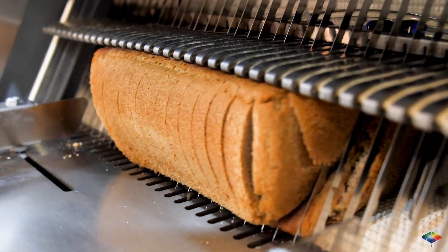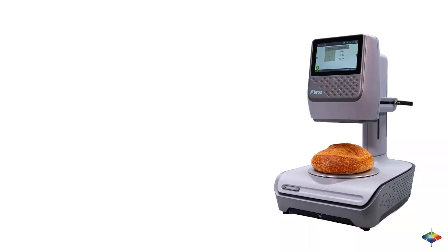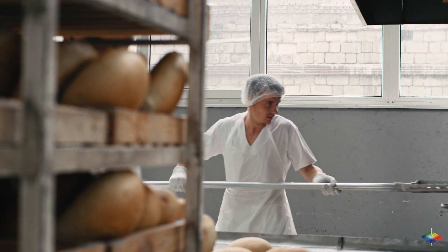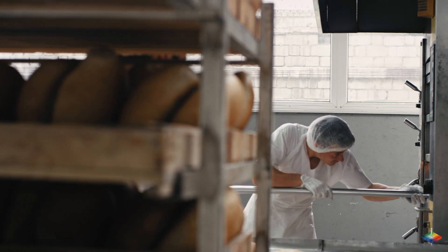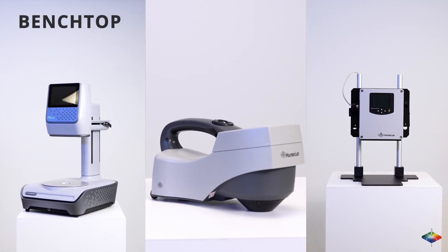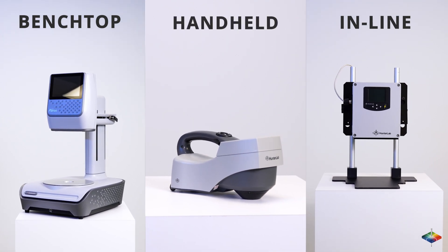These features accelerate the quality control process by shrinking the time to measure multiple samples. Whether in a lab, plant, or on-the-go, Hunter Lab offers the best color measurement solutions for your unique needs, including benchtop, in-line, and handheld spectrophotometers.